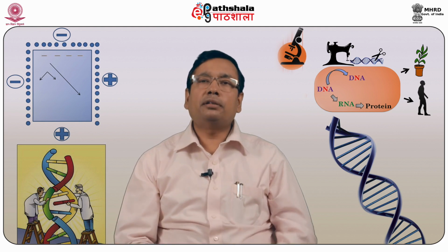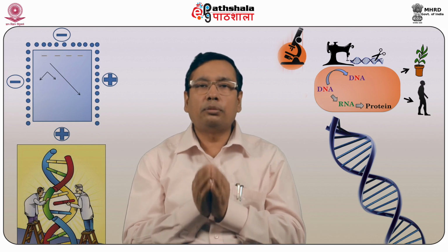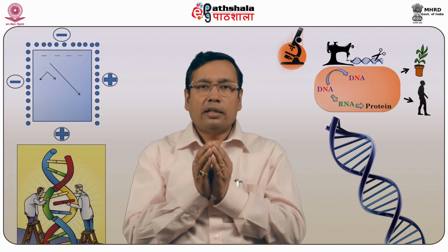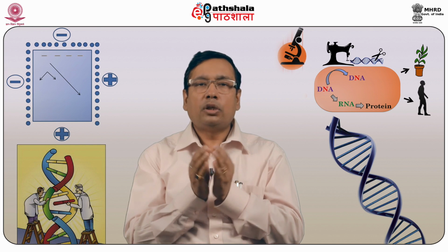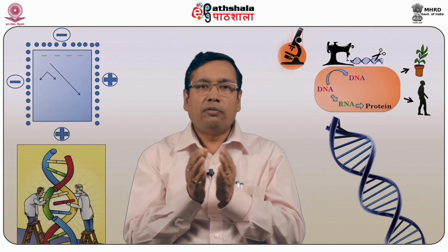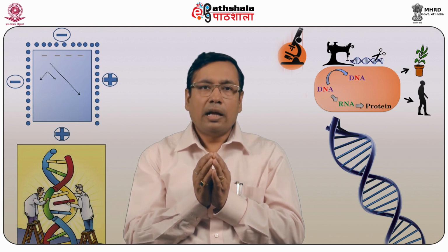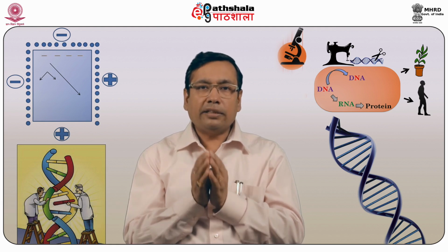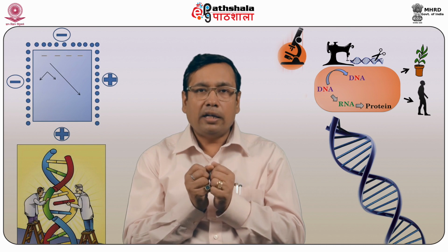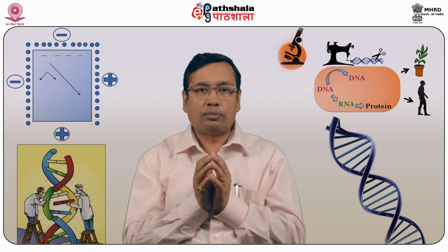PCR was first described in the mid 1980s by Mullis, who was also the recipient of the Nobel Prize in 1993, where PCR amplifies with the help of Taq polymerase, a polymerase which can sustain high temperature, derived from the bacteria Thermus aquaticus. It is an in vitro method for enzymatic synthesis of a specific DNA sequence, which amplifies DNA from a heterogeneous pool of complex DNA or cDNA probes.